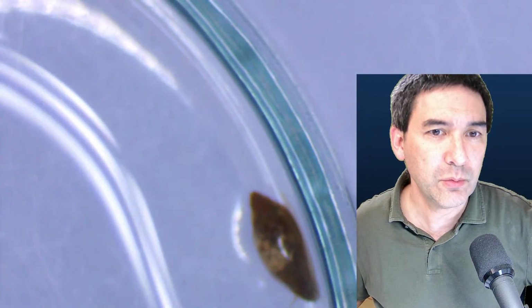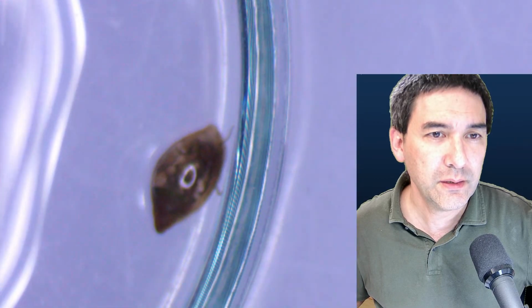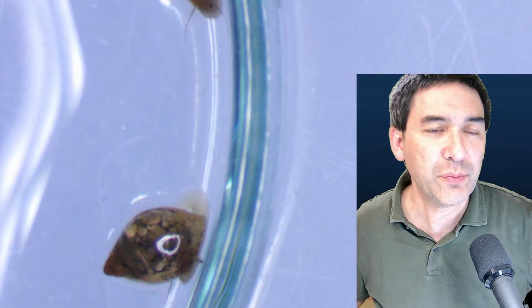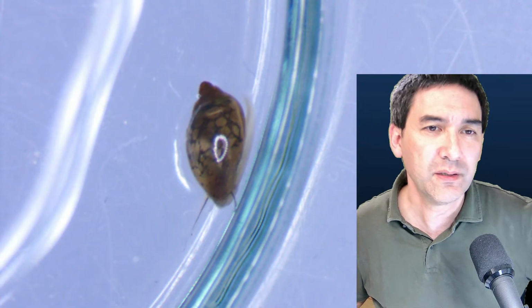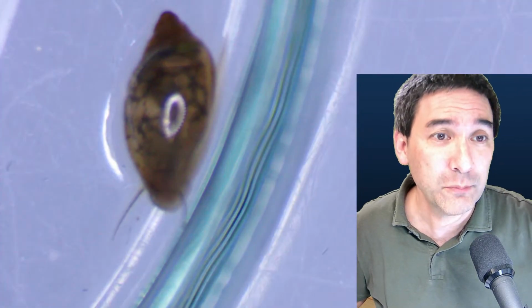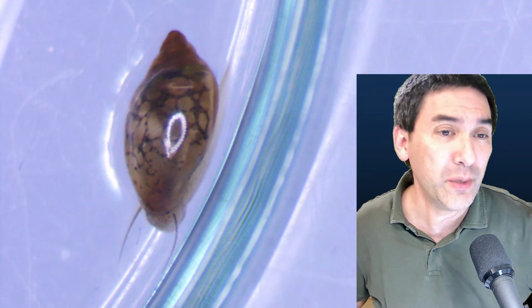Look what I found here. It's a little out of focus. So under the stereo microscope, the snails are around 3 millimeters in size. The camera always adjusts the exposure time. But this is the reason why we put them under microscopes, because they look much better. And you see details that you would otherwise not be able to see.